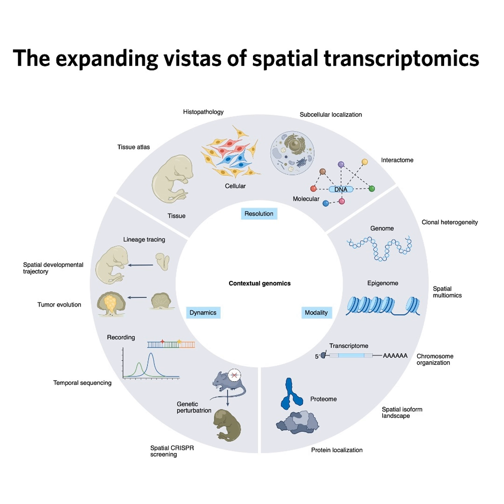So the dream is a unified map showing DNA status, RNA expression levels, and protein locations and interactions all in the same tissue section. That's the vision, a truly multi-omic spatial atlas. Which leads directly to the next point, resolution.